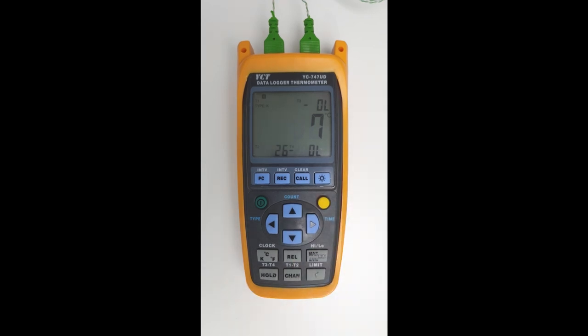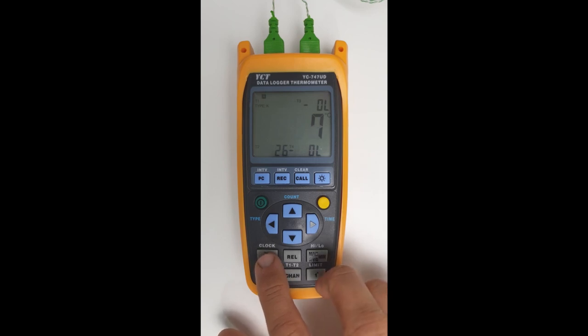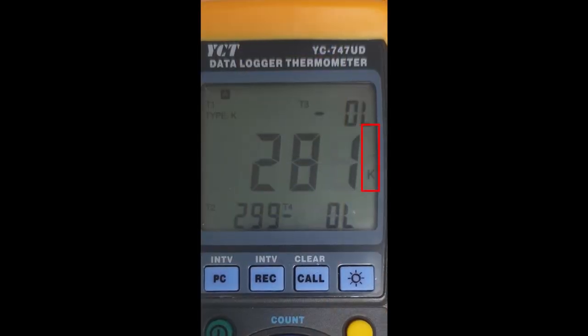The next thing we're going to do is make sure that we've got the correct unit. At the moment it's on degrees Celsius. If we click on the same button without clicking on shift, we can cycle through the various units. Clicking again goes from degrees Celsius to degrees Fahrenheit, once more would be Kelvin, and clicking again goes back to degrees Celsius, which is what we're going to be measuring.